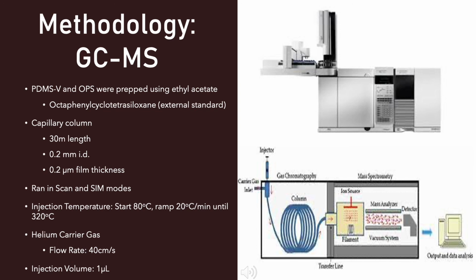After the analyte is injected, it travels through the column to the mass spectrometer. Inside the mass spectrometer, it's stopped at an ion source where it's ionized and fragmented. The fragments then transport through a mass analyzer that's held under vacuum so that everything doesn't just decompose. The smaller fragments will travel faster to the detector because they are lighter.